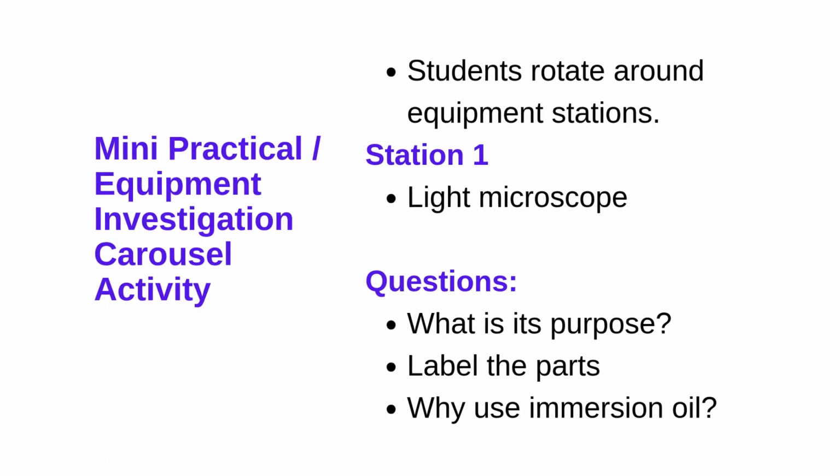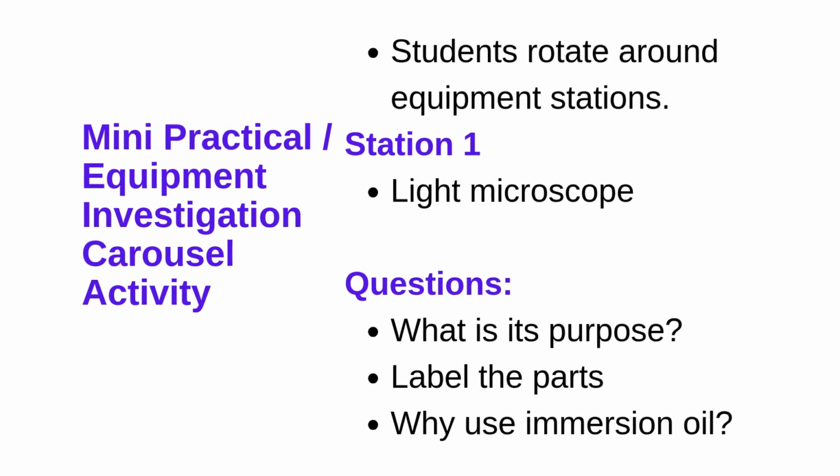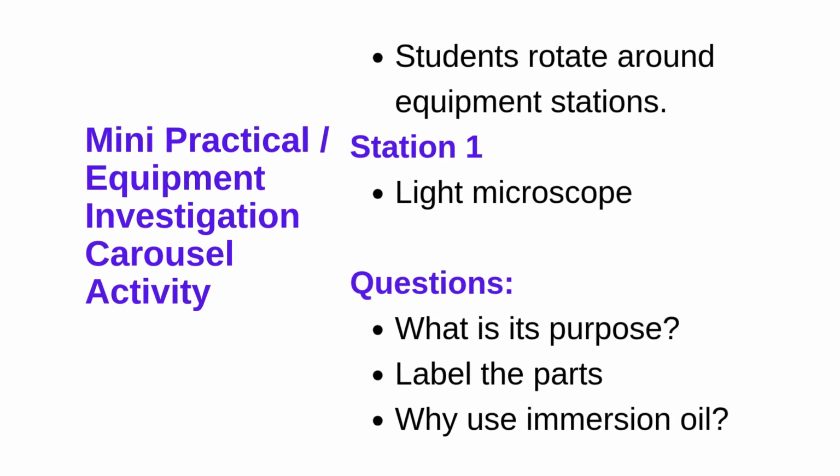At Station 1, investigate the light microscope and identify its main parts. Consider its purpose in microbiology and discuss why immersion oil is used when viewing bacteria at high magnification. Focus on how the microscope helps scientists produce clear and accurate observations.